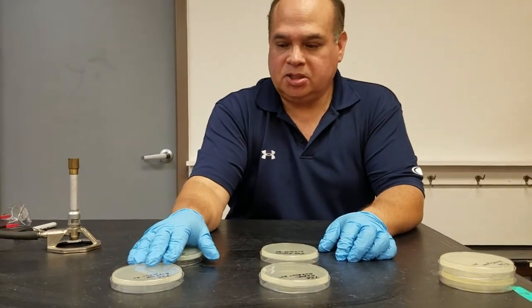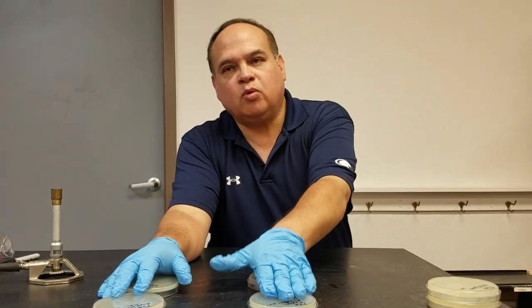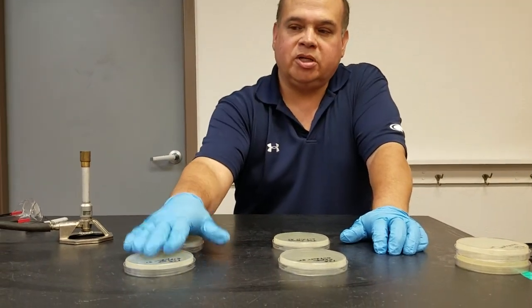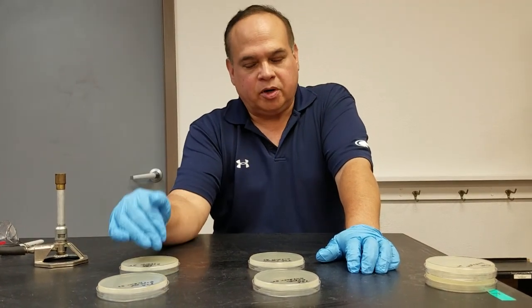These plates are going to be exposed indoors. So to summarize: these plates are unexposed, these plates are exposed outside — one at 25°C, one at 37°C — and these are going to be exposed indoors for 20 minutes. One will be incubated at 37°C and one at 25°C.